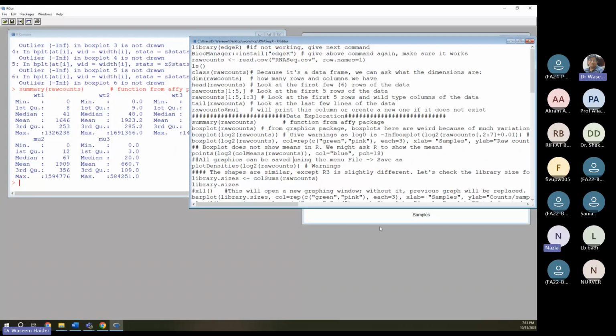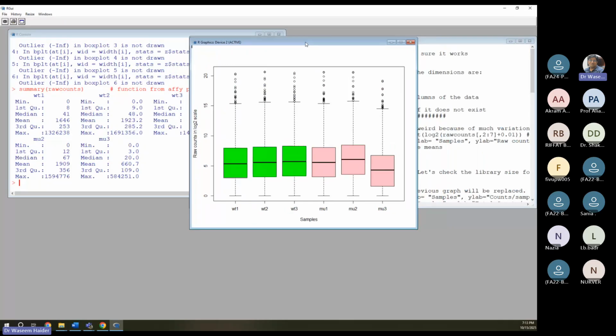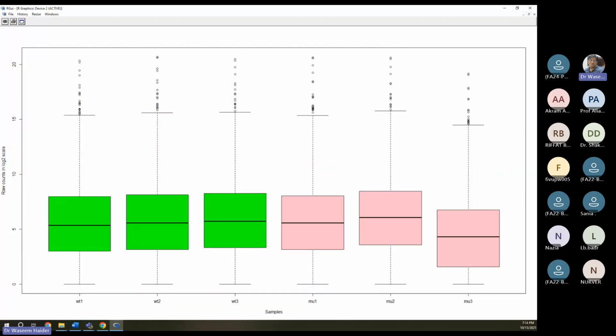Yes. Okay. So here, can somebody comment on these box plots? The biologists, it's for you, it's your data. So what do these boxes tell you? These were your gene expression data. Okay. So we need to talk about the biology behind that. Is gene expression something that is distributed normally? Anybody? When it comes to stats, you all go silent. So I'm sorry, I'm not covering stats here, but in the second module, the class next week is all about data analysis and stats. So feel free to join that.